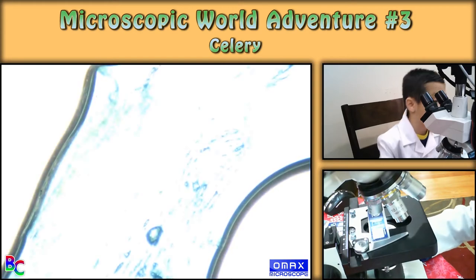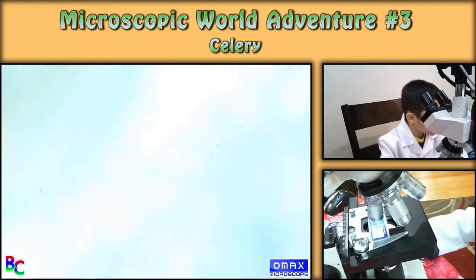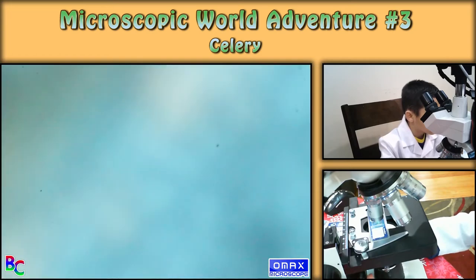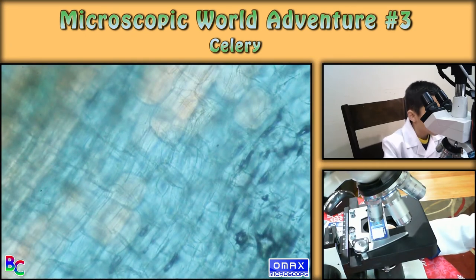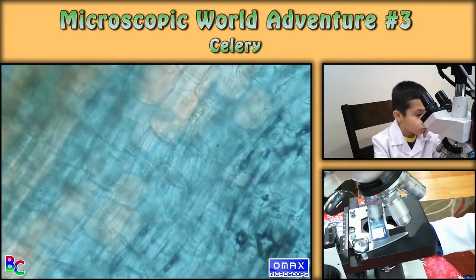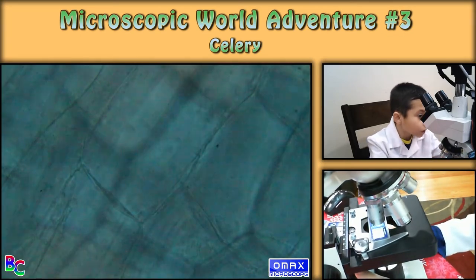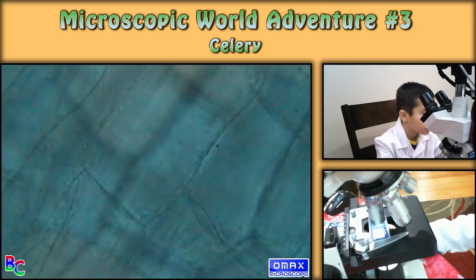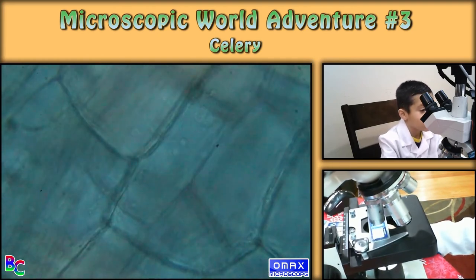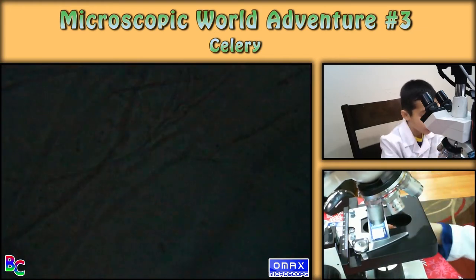I'm gonna focus up with less light. This is the blue. Whoa, why does everything have like lines or squares or colors? I had no idea. I'm gonna focus up to the last one and get all the possible detail. It looks like ice cubes — I don't know why.